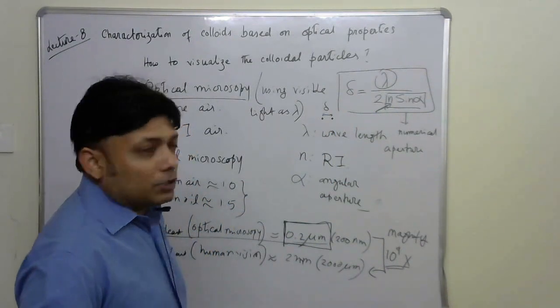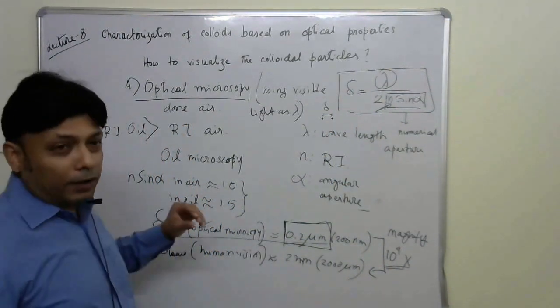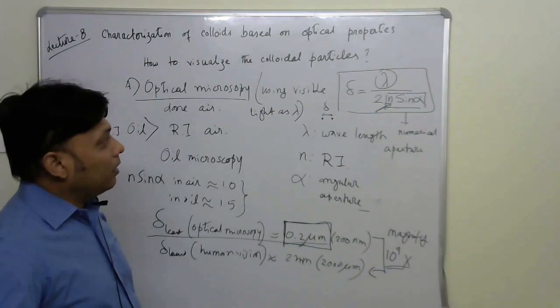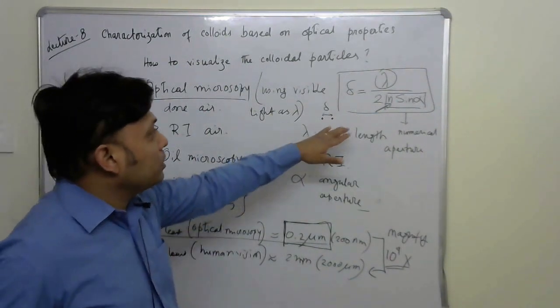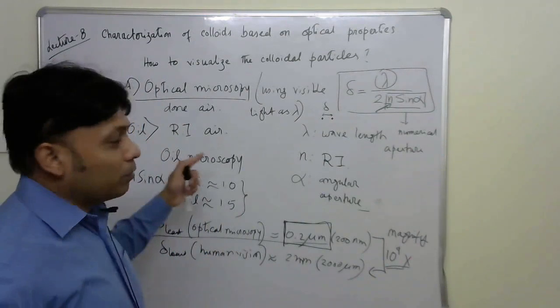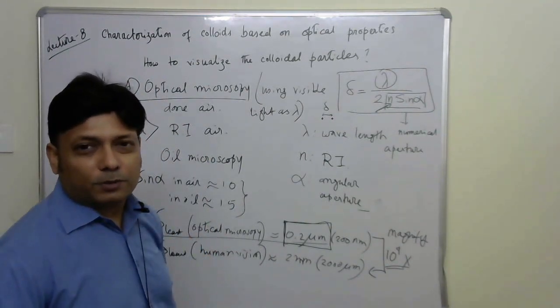All right. So now we move on to discussing very briefly about electron microscopy, where we would use the electrons as a primary source of this lambda for microscopy. So let's clean the board and move on to some very basics of electron microscopy.